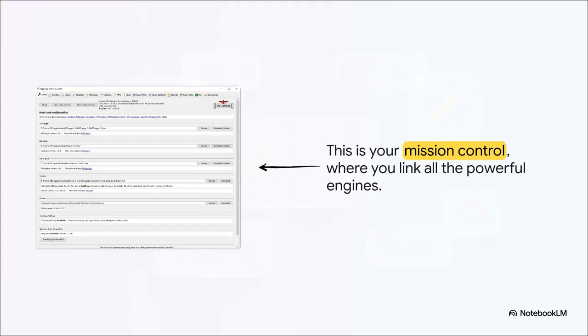See, this Config tab is your central dashboard. You link everything up just one time, and from then on, FragPipe knows exactly where to find all its engines for every analysis you run. It's a quick, one-time setup that puts some serious analytical power at your fingertips.